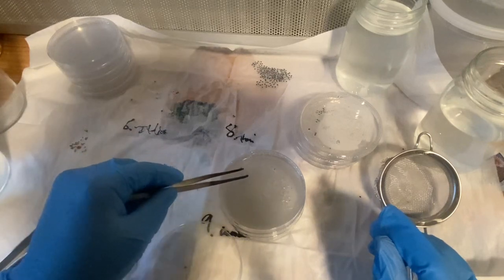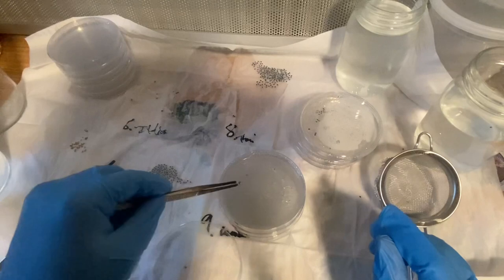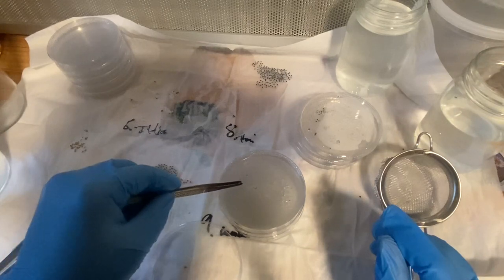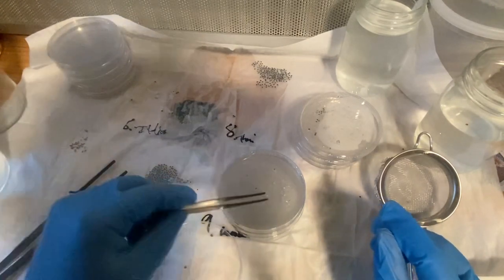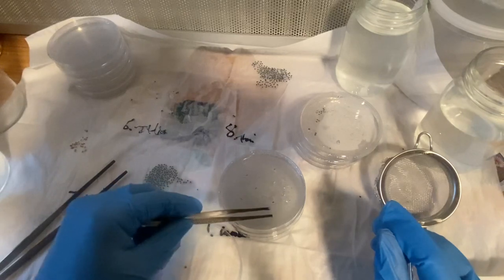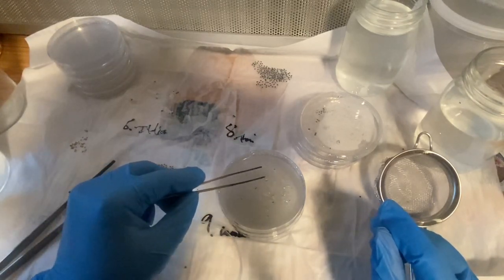You can tell without all that mucilage, I can actually pick up a couple seedlings and spread them out appropriately. This is a great way to do germination tests as well. If you're a gardener and you want to see how good your seeds are, you can go ahead and put a certain amount of seeds down and then score your results.